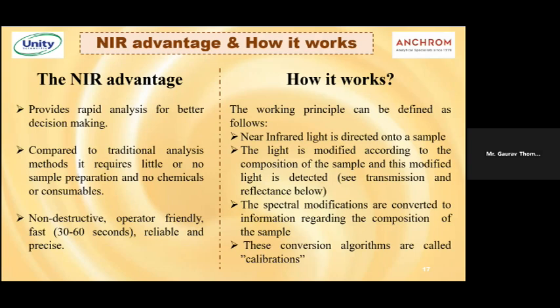Compared to a traditional analysis method, it requires no sample preparation, no chemicals, and no consumables. Any product that you analyze over the NIR barely requires any sample preparation. Suppose you have a hard solid sample; it just needs to be crushed and homogenized.